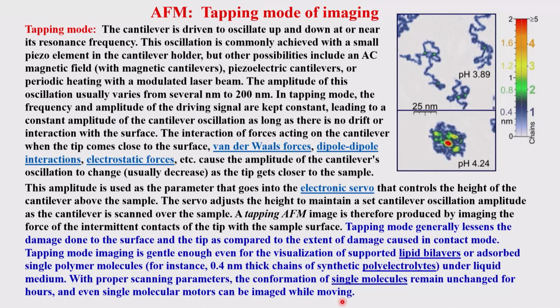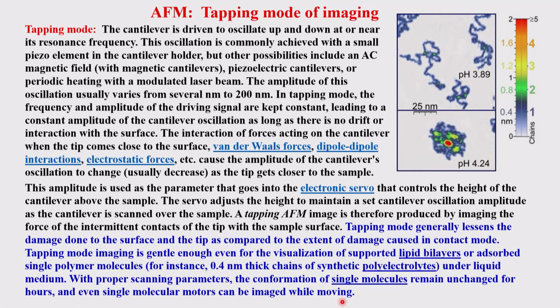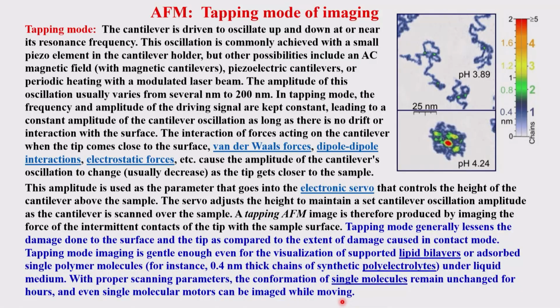The contact mode can cause grazing, can make some dents, and can spoil the tip of the cantilever, the tip of the probe. All of these are possible, whereas that is not so with the tapping mode. So you can use it for a variety of fragile biological samples, to map and image them to a nice atomic, nanometric level of resolution.